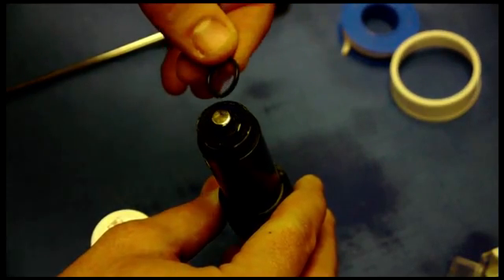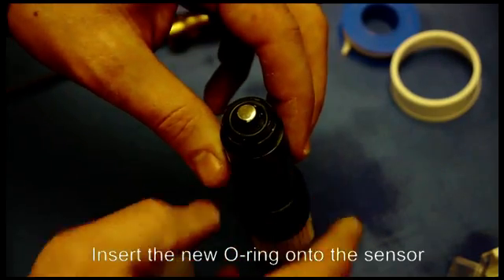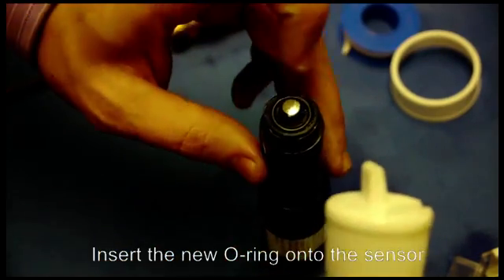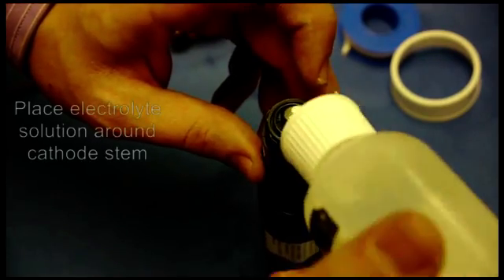Next you want to take your new O-ring, place it around the stem of the cathode, and then use fill solution and cover the tip of the cathode.